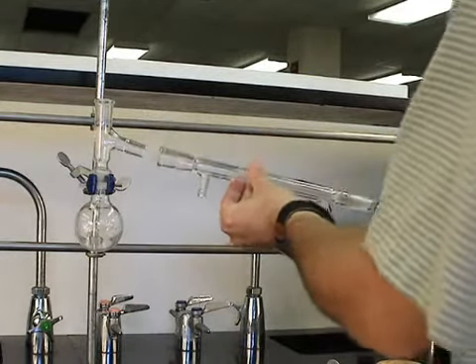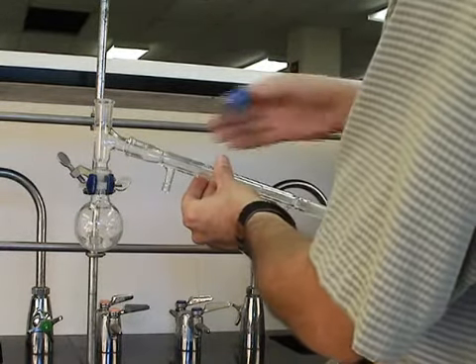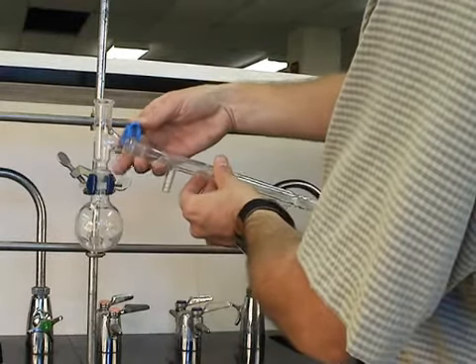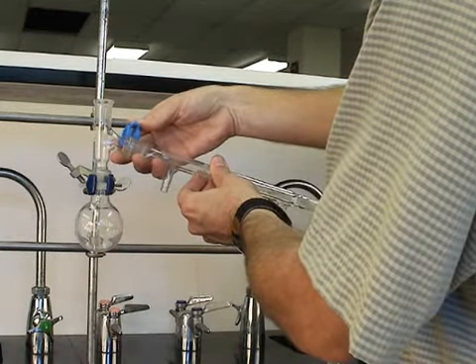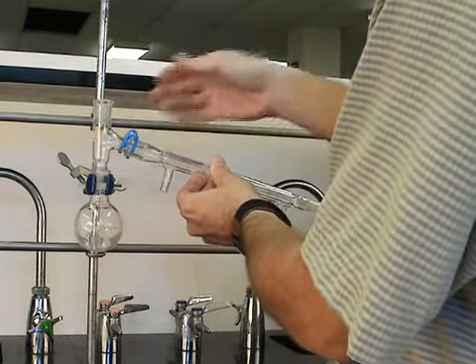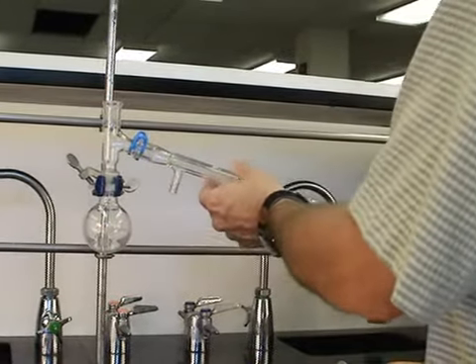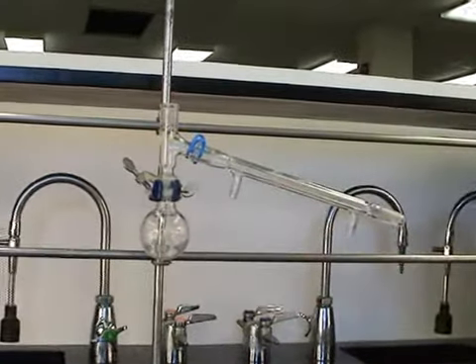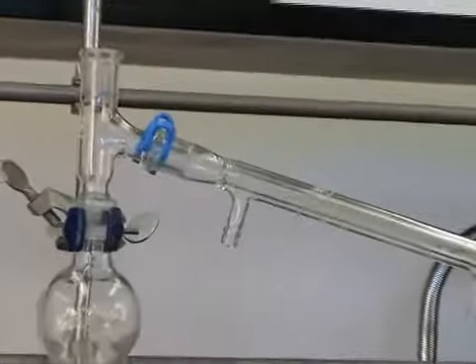We next use a Keck clamp to attach a distillation condenser. This is the smaller of the two condensers in your kit. Make sure you have the Keck clamp positioned properly. There's a large end and small end. And push it on to snap and hold the condenser in place.